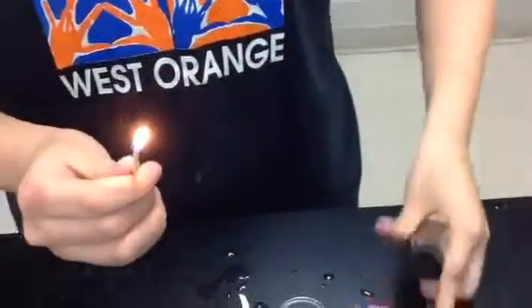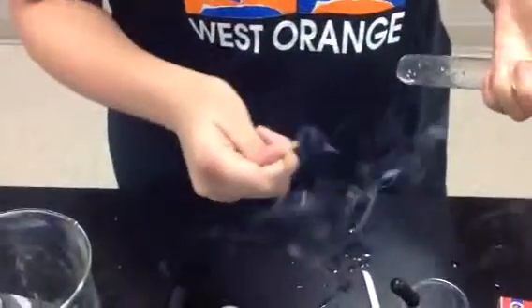Take the lit match, place it in front of the opening of the test tube and close quickly. This test shows no results for the match test.